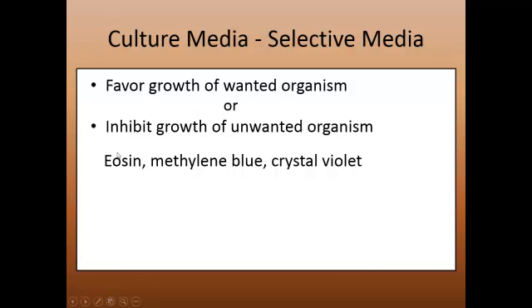So a lot of our selective media we will put stains in. So with these stains, they all inhibit gram-positive bacteria without affecting the growth of the gram-negative bacteria.